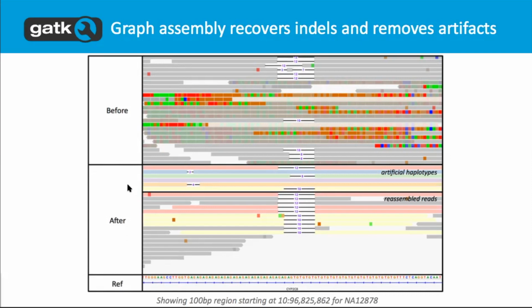So haplotype calling is something we should do regardless, if you're looking for variants. Why wasn't BWA extended to produce such output? It's a lot of extra work, because the nice thing about BWA processing reads independently is you can parallelize and multi-thread quite extensively. And BWA is already doing a lot of work.